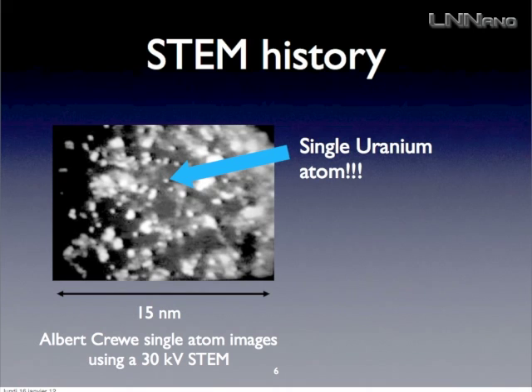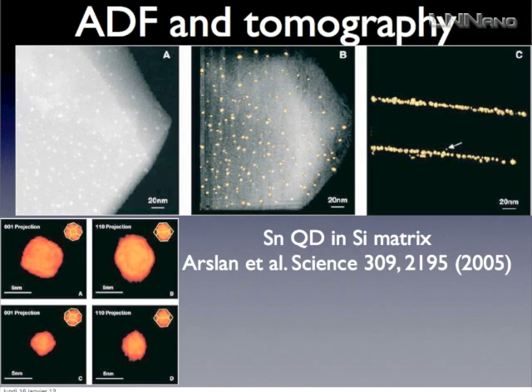So if you want to leave my lecture now, it's not a problem. You can, because the main point, when you will be on the microscope, is if you want to have a lot of sensitivity, use dark field. And then all the rest is, I mean, just blah, blah. Okay, but please stay for my blah, blah.